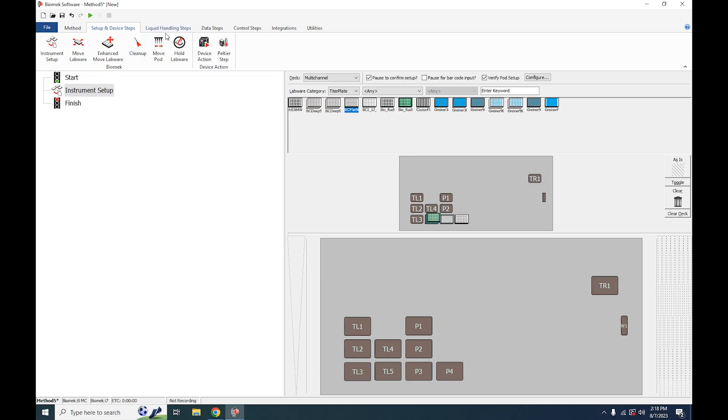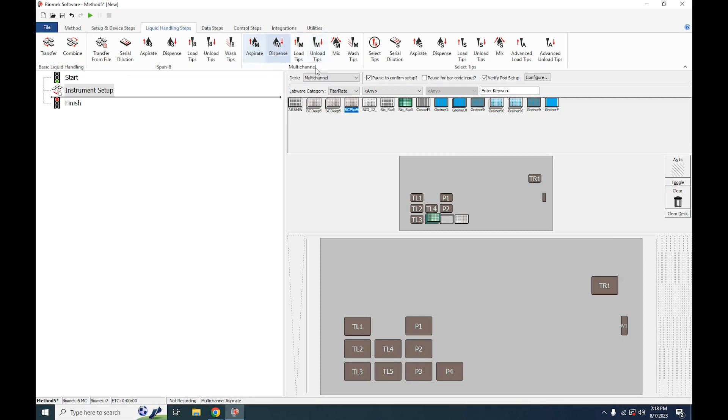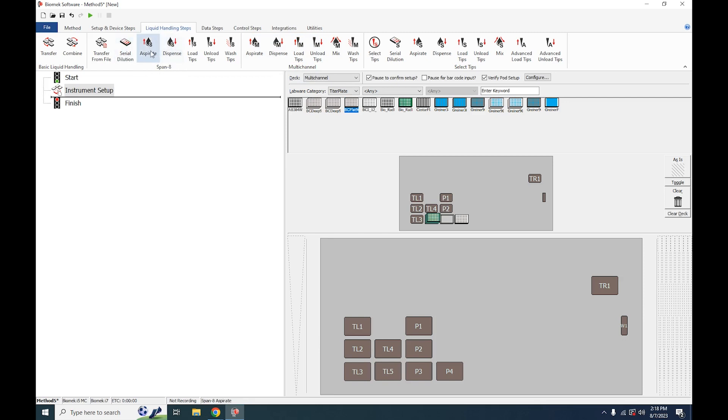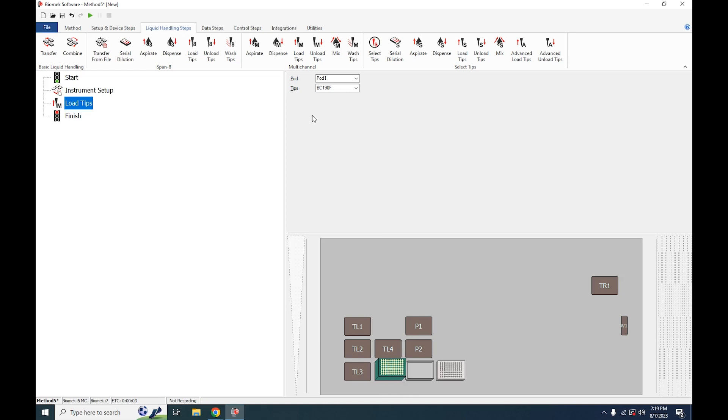Now we will go over to the Liquid Handling Steps tab, and the first thing we're going to do is load tips. Make sure you're loading tips from the multi-channel section if loading from a multi-channel pod, or the Span-8 section if you're loading from a Span-8 pod. All the icons will have the designation under them to indicate which one you've selected. Click Load Tips and then click on whichever tips you'd like to load, and this will automatically populate this dropdown menu with the correct option.